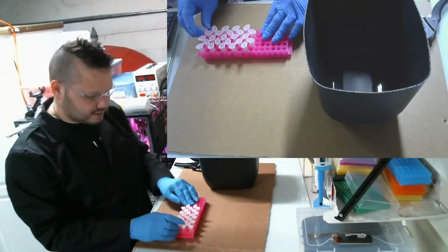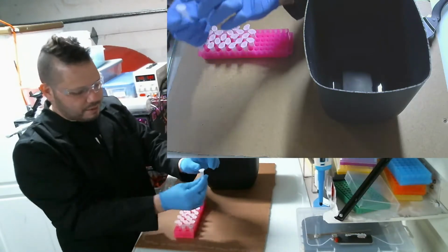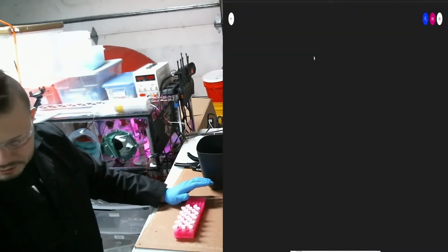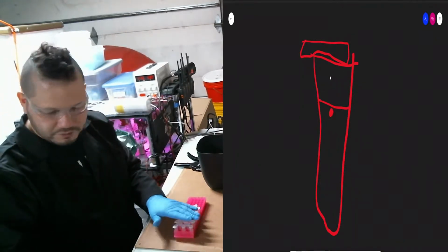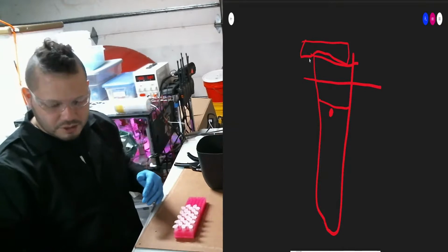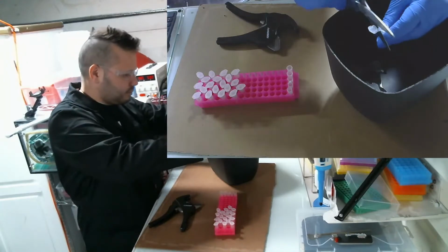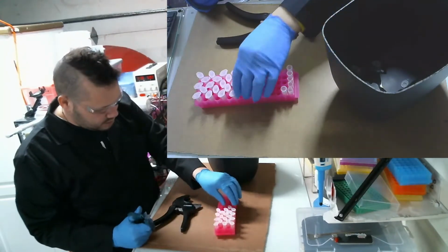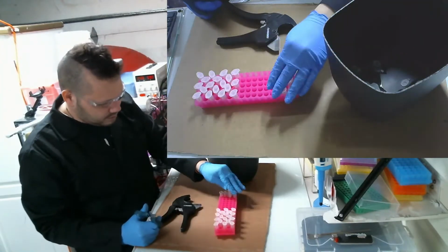And one last step I've got to do is cut the top off of this. If you imagine the centrifuge tube, it has a top on it. Well, I've filled it with agar, and then I've planted a seed in there. Now that it's been in the fridge for 24 hours, I'm going to cut this section off. That way it can grow and sprout. The idea is they're like little planters that I can grow the plants in.